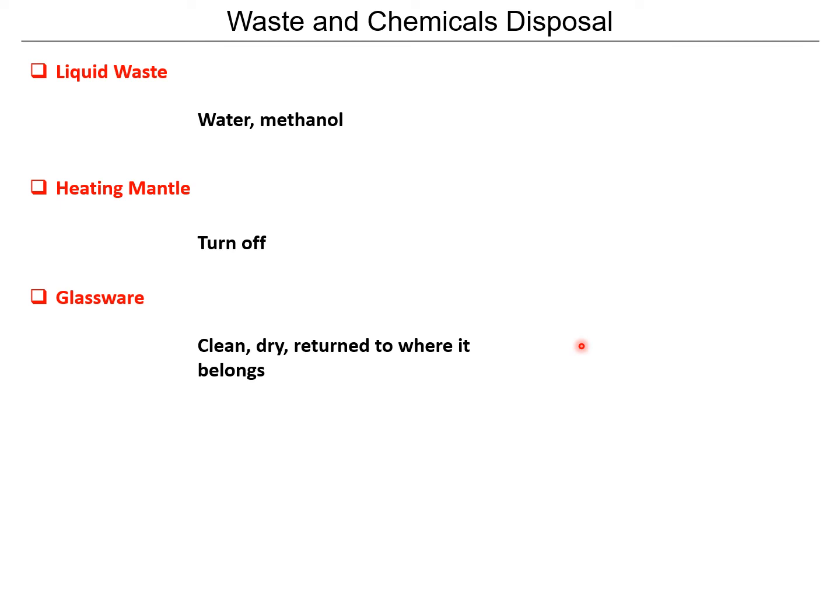And of course, all your glassware, make sure you clean it. Try to dry it, of course, and return it to where it belongs, which is those little cases that are in each of the stations, right? Other than that, that pretty much wraps up this lab.